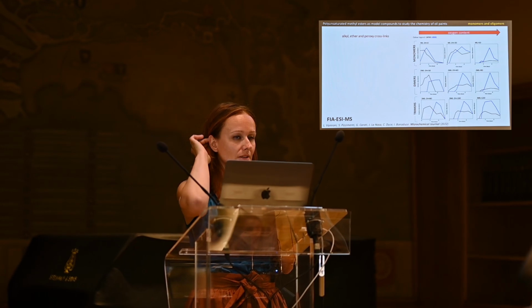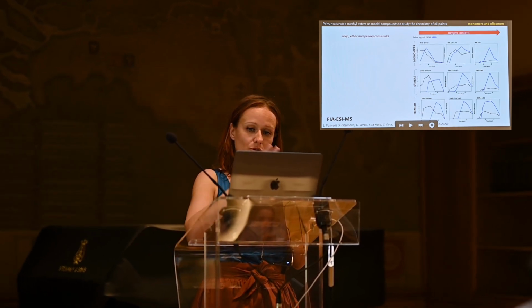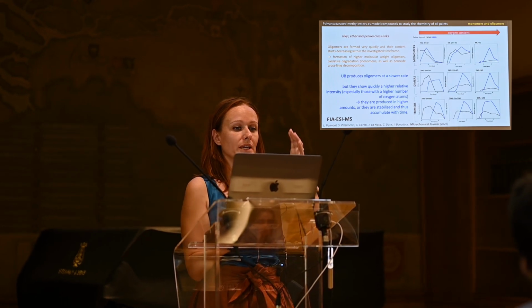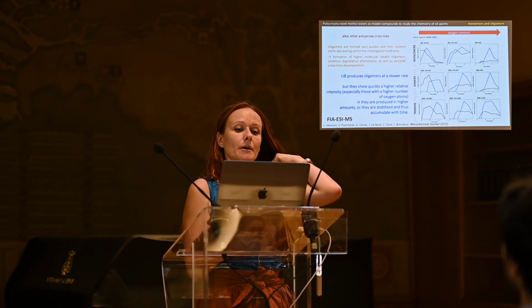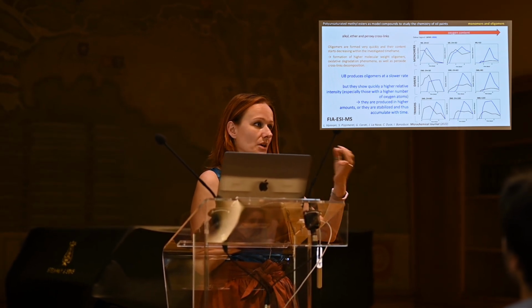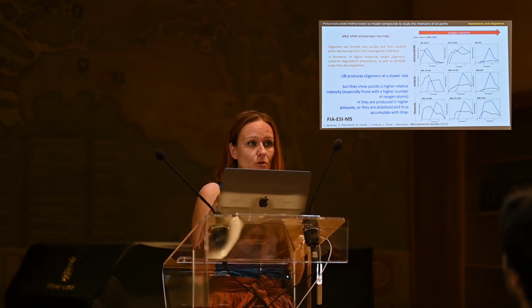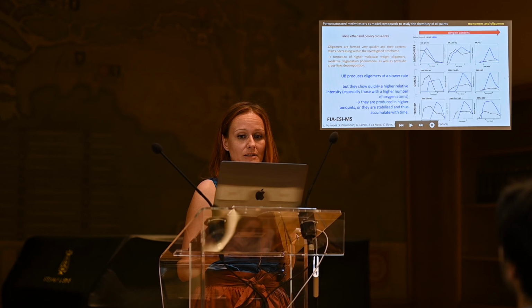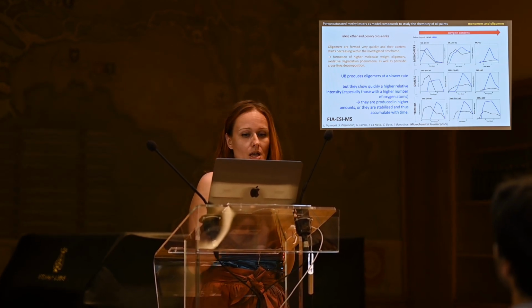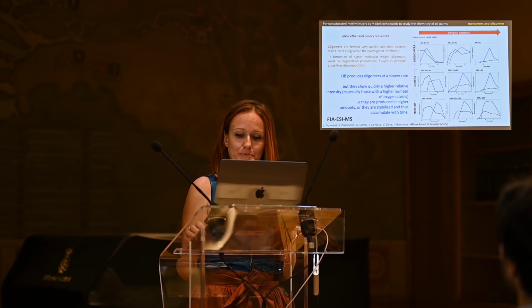And again, we can monitor the evolution with time. So monomers, dimers, and trimers, and then when we go from left to right, you can see that we have a higher amount of oxygen in the molecular structure. And basically, we can see that oligomers are formed very quickly, but then their content disappears with time because they become involved in other cross-linking reactions, or if their bonds are peroxide bonds, they become degraded with time towards other reaction pathways. But we can also see that ultramarine blue produces oligomers at a slower rate, but the higher the content of oxygen, the higher the amount of these oligomers is with time, also compared with lead white. This could be because they are produced in a higher amount, or just because they are more stable and so they do not decompose with time and they accumulate.